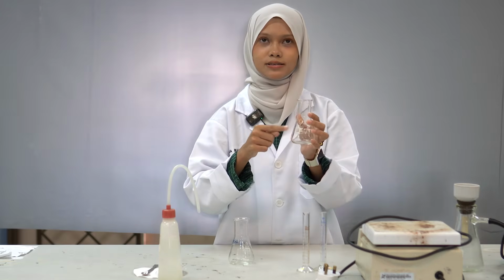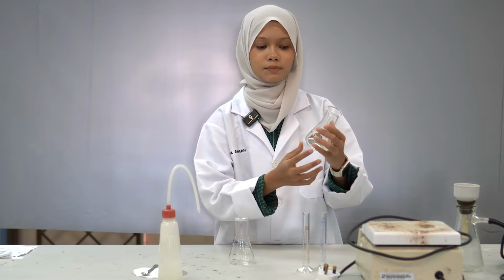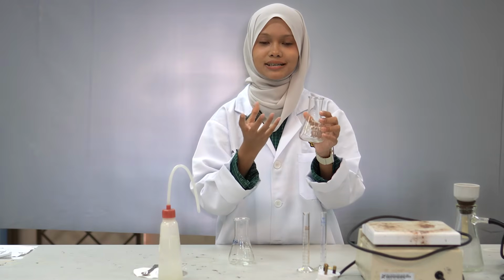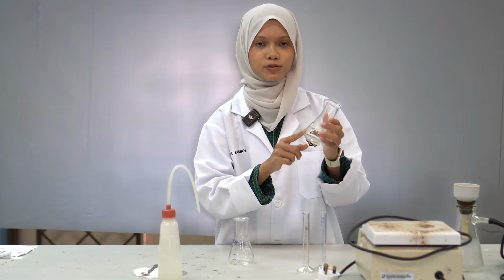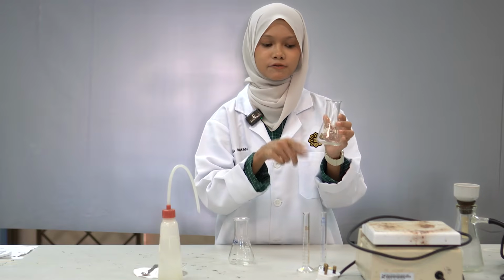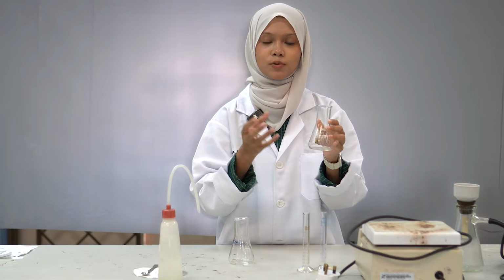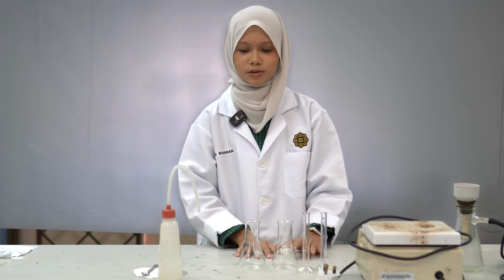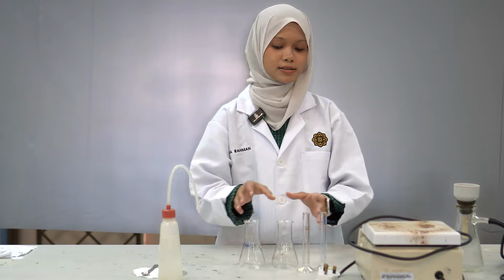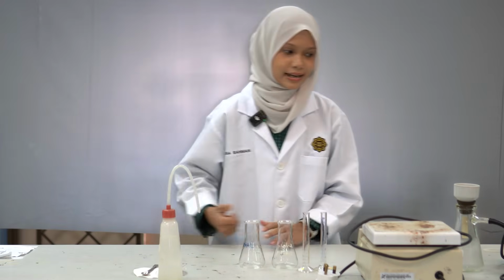And for the mixture solvent flask that we immersed into the ice water bath, the dry crystal produced is less defined because the acid molecules crash out of the solution fast. So for the vacuum filter next, I'm going to pass to Sister Alia.